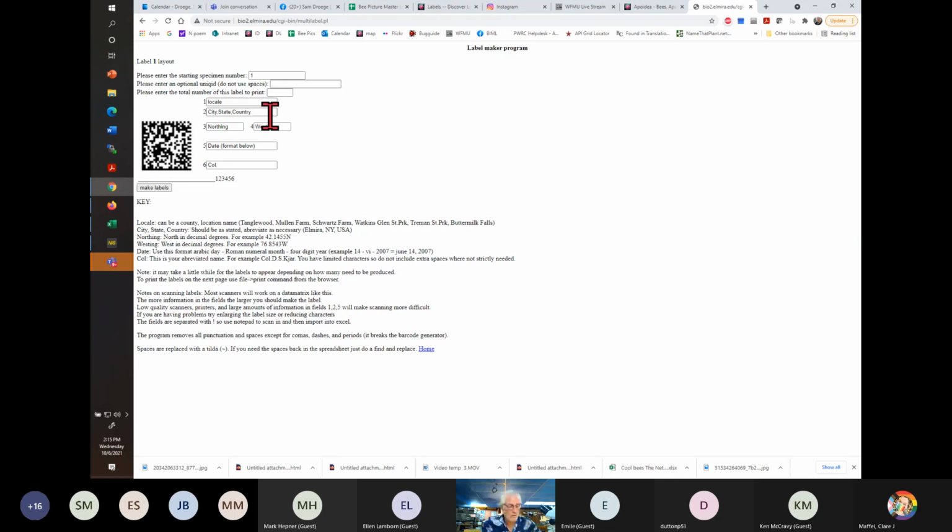I'm going to get one right now. So if you can see this box, you'll see specimens with their label that was generated by Discover Life. If the specimen is vertical, that's a female.